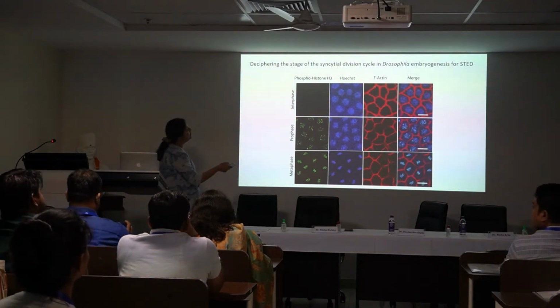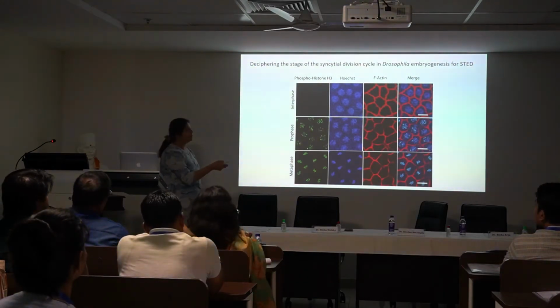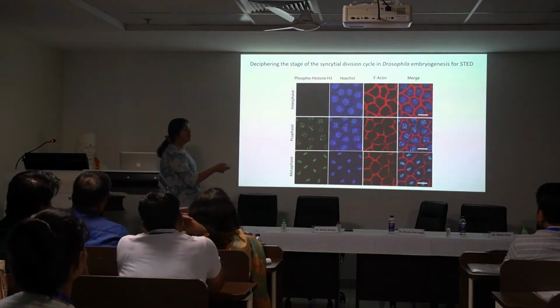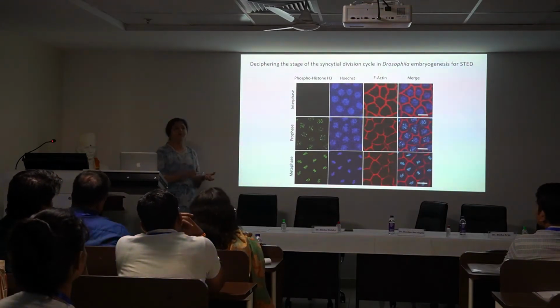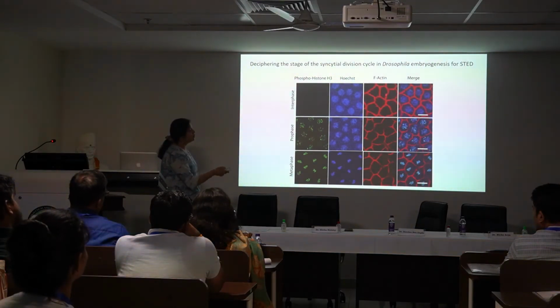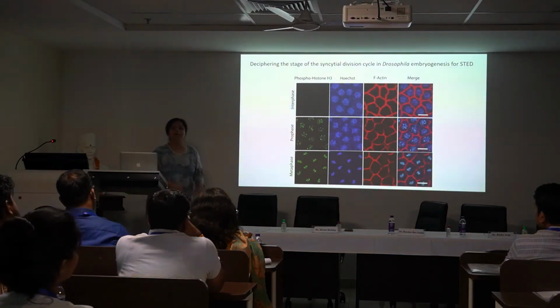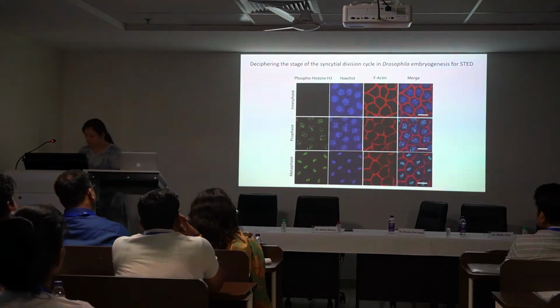We can label the membrane with a marker which is membrane specific. In this case, we want to look at villi, and these villi are rich with actin. So we are using an actin marker, right? So you can see that this actin marker is somewhat changing its distribution. It may be a little more ruffled here as compared to here, right? But now can we visualize villi better, right?